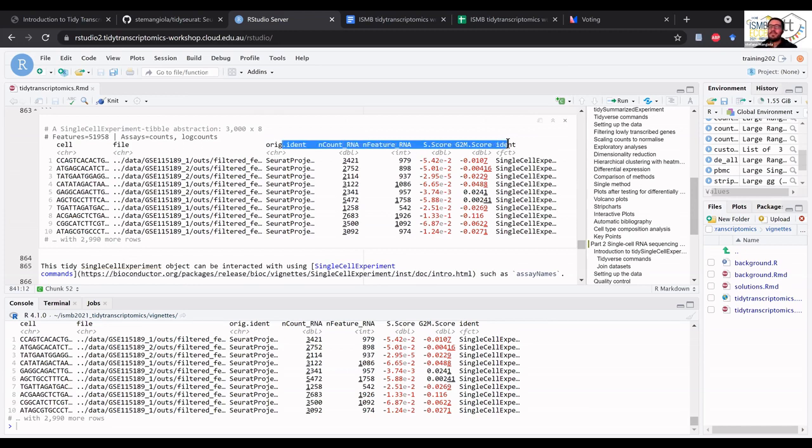By default, the information that is displayed is relative to cells rather than genes, and this is because cells for single cell experiments are very much a point of focus. So it's the element we analyze most. But as I will show you afterwards, we can join transcript information very easily for doing visualizations and summary statistics and whatnot.